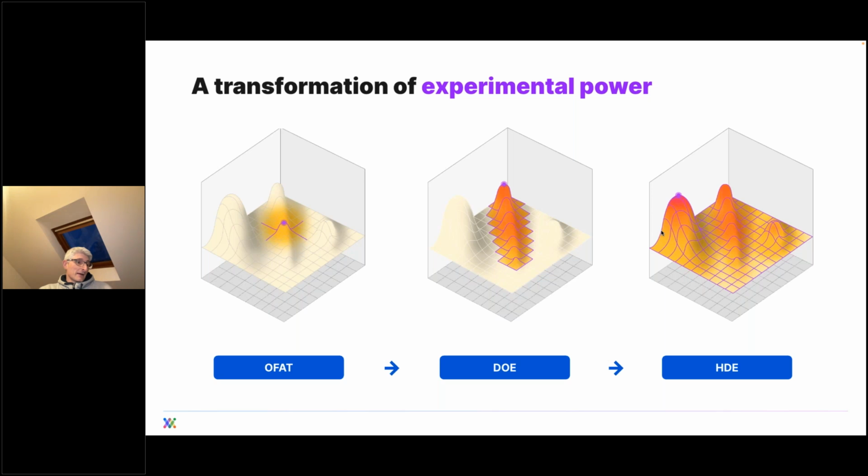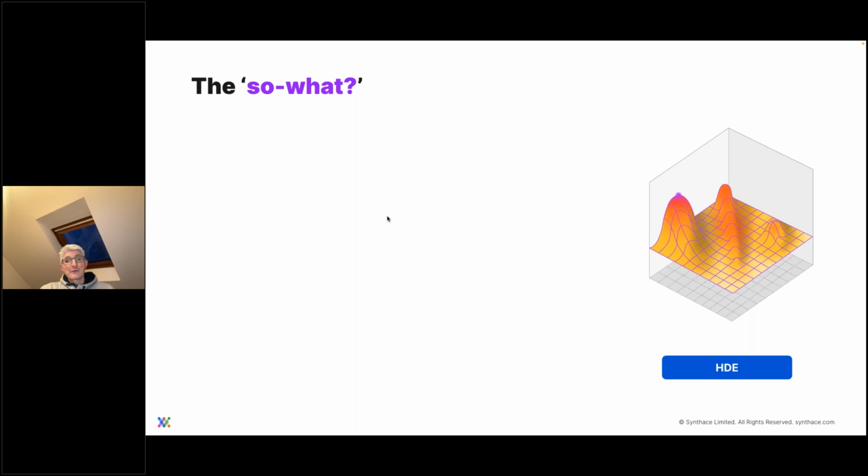And it's just a product of the fact that there are some biological systems, particularly when we're thinking about assay development or when we're thinking about media development for complex cell line differentiation and expansion, that we can scale down quite effectively. And so that means that we can get this kind of run number, which means that we can address biological complexity to a kind of degree that we might not have been able to experience in the past. But like, it's to a final so what?